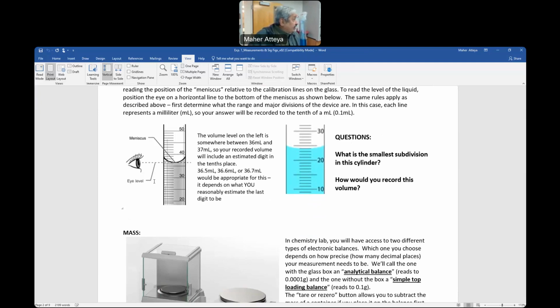What's that? There's no Excel tool. Okay, there is one here. Someone is up front. So this is what the error is. Always estimate The exact number is straightforward, but then when in between number, you can just estimate the whole thing.